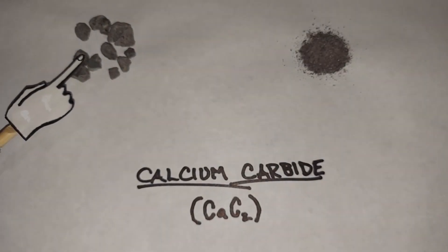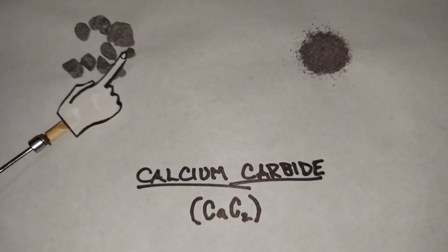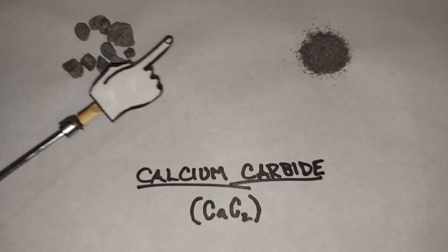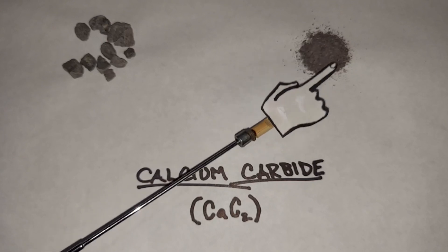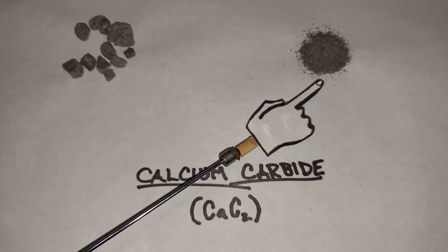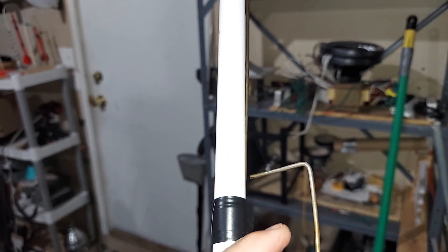This is our calcium carbide — you can see they're much larger chunks, a lot like little rocks or pebbles. It's much safer to ship it in this form. What I did is crush it almost to a powder — not super fine, more like sand. This crushed form is going to have a lot more surface area than the large chunks, and this is what I'll be using in the water bottle. Working with acetylene is brand new to me — I've seen videos; it's very flammable, explosive, and loud.